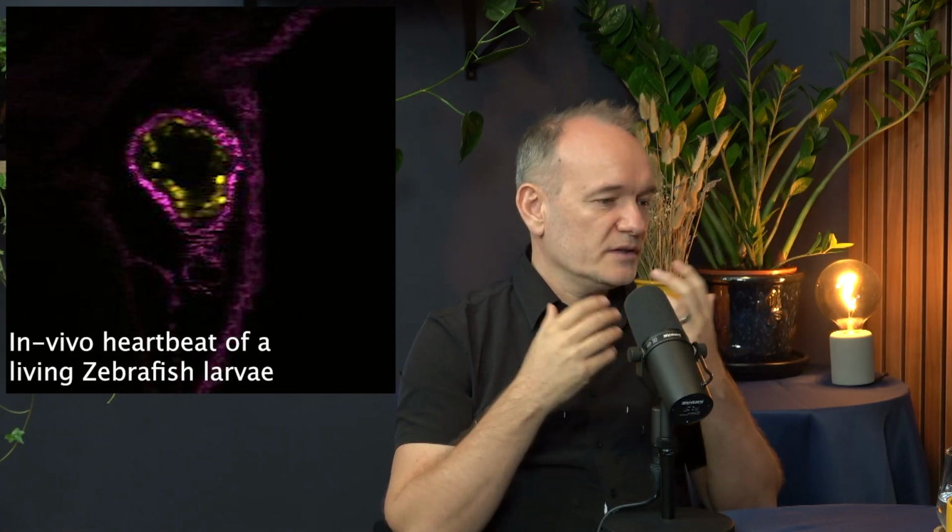And there's another advantage: you can do better time-lapse imaging. Because a two-photon microscope only interacts in this very tiny spot with the tissue, it's much more gentle on the tissue. So photobleaching or phototoxicity is less of an issue. That means you can of course work with a sample over a much longer time scale, doing time-lapse imaging, or just seeing how the cells grow or split or behave over time, which is better to do with a two-photon microscope than with a conventional microscope.